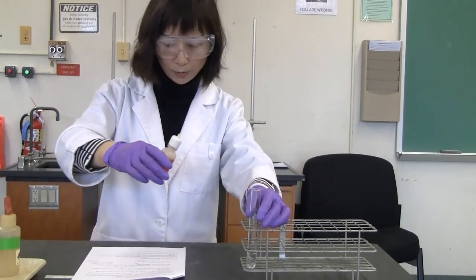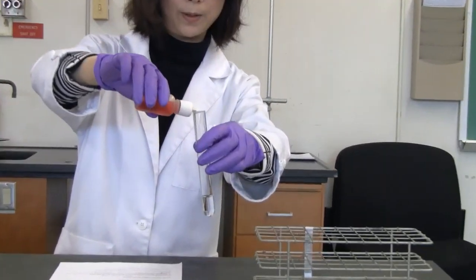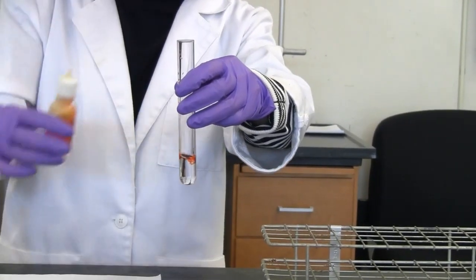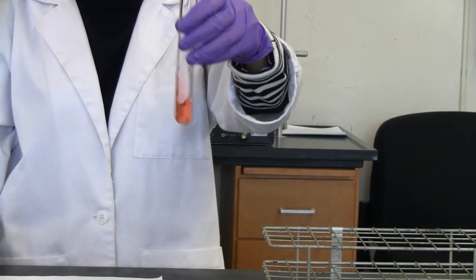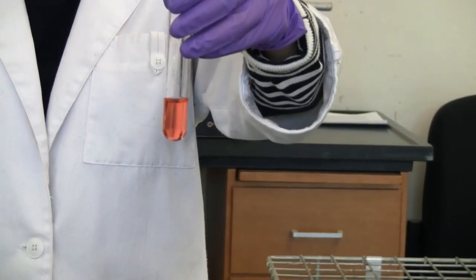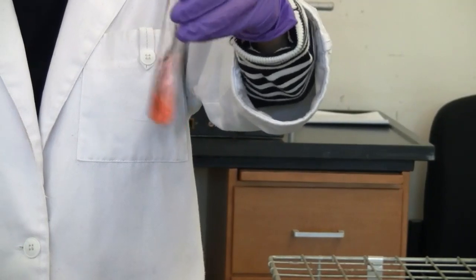All right, and I'm going to add 1 drop of the methyl orange indicator. Now you're going to observe the color of the test tube. 1 drop. What color is the solution in the test tube? You can answer that question.